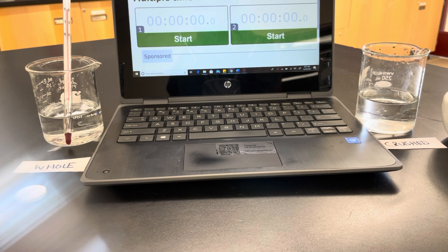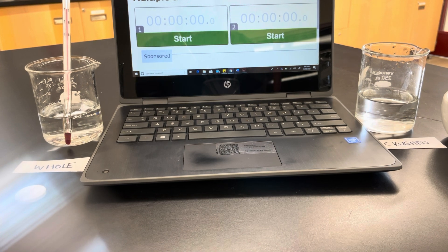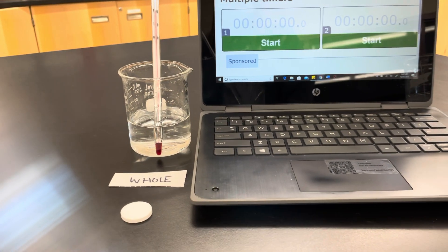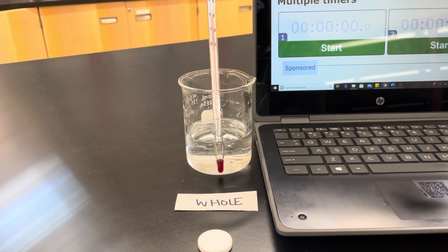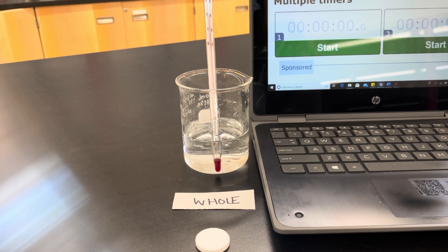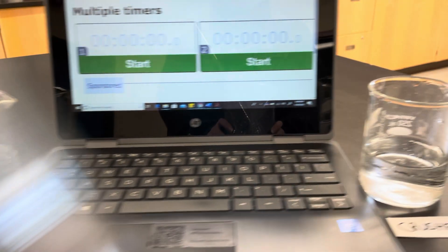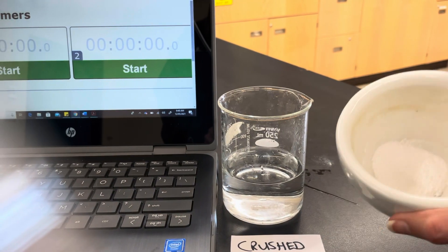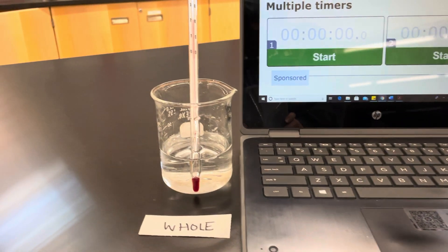For part one of our investigation on two factors that affect the rates of reaction, we're going to look at the difference between a whole Alka-Seltzer tablet reacting in water versus a crushed Alka-Seltzer tablet reacting in water.